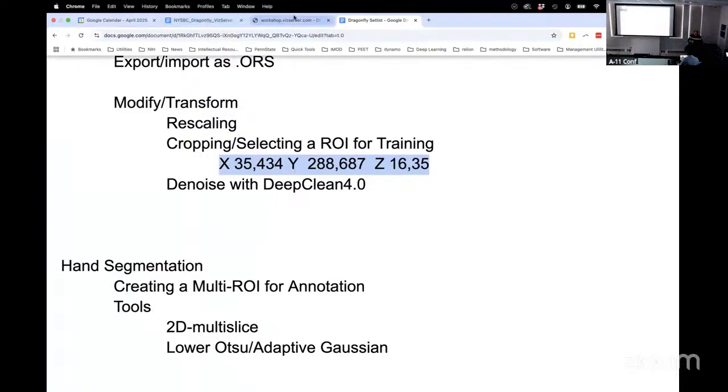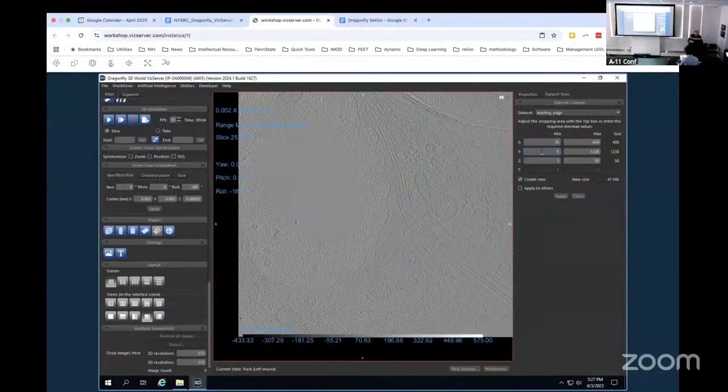288, 687. I think this is going to do something weird, because this is an old version of Dragonfly.